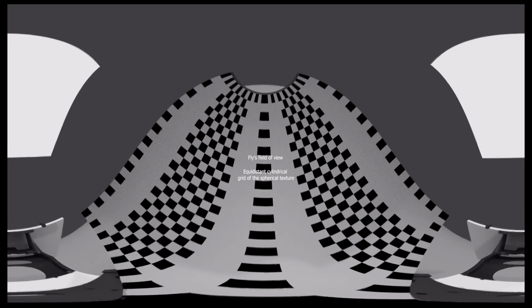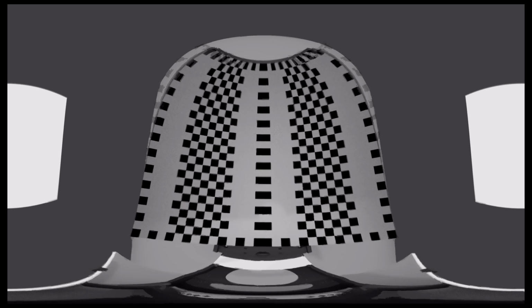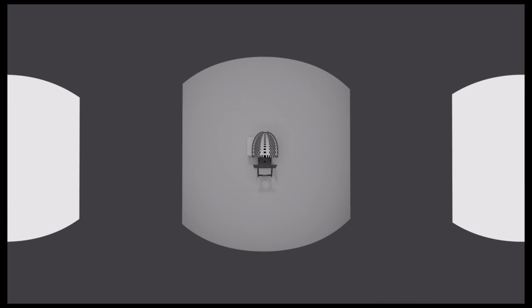The perceived spherical texture allows the insect to be immersed in a virtual environment. This can also be demonstrated in a real system. You are now the insect standing in a virtual cube inside the Super Bowl screen.